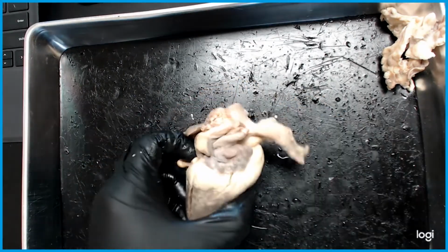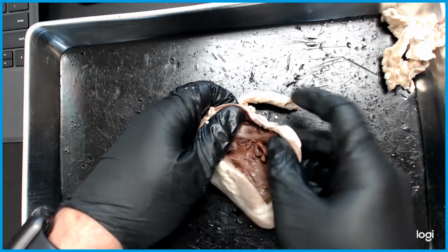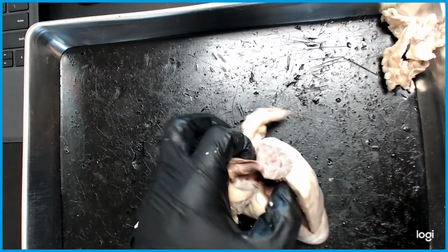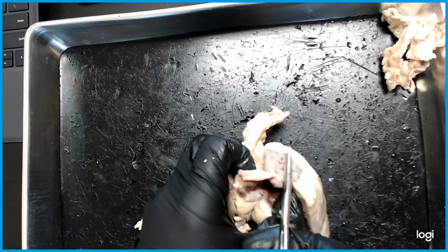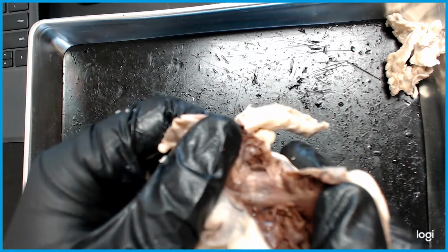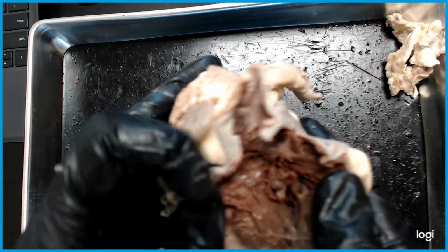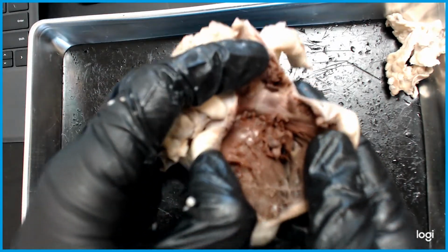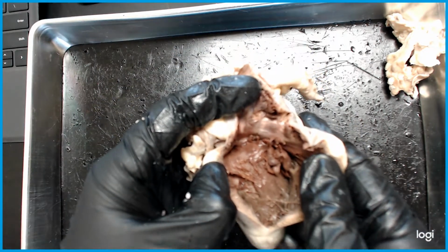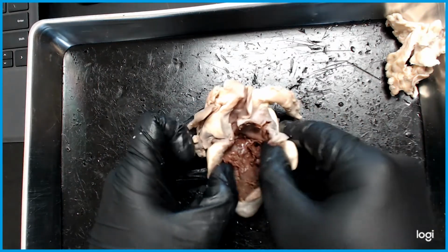When we closed it, we said that we were at the superior vena cava, or just the vena cava, goes into the atrium. There's the atrium. And if you want to further look into the atrium, you can cut that open. And this is what we're seeing. I'm waiting for the camera to focus. Okay. That's good focus. Now we can identify the parts.